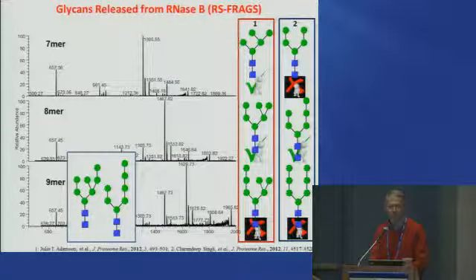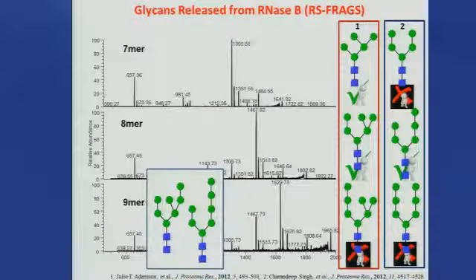So they may actually both be present there. But this would, I think, require further characterization, perhaps with ion mobility spectrometry, to be able to distinguish those in comparison. The fragmentation patterns, if you had the bona fide materials, could also be used to distinguish them, because they are different, but they don't really distinguish those two possibilities there. So that's where we are.